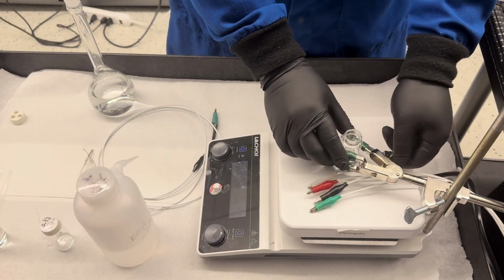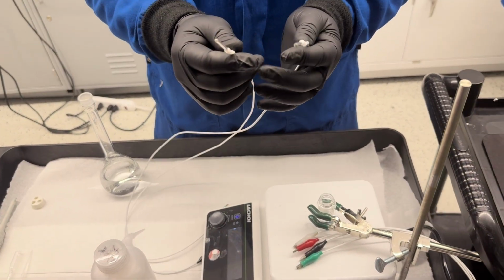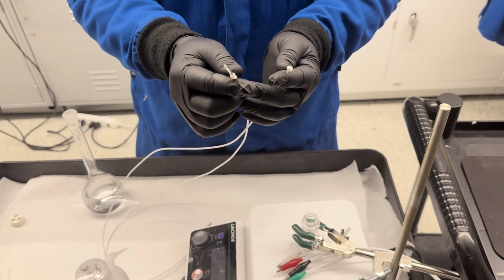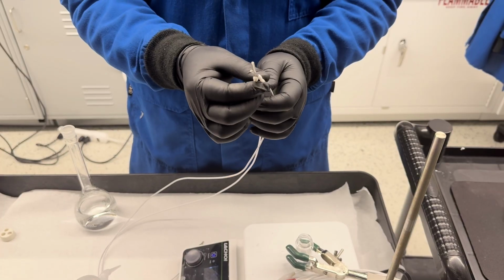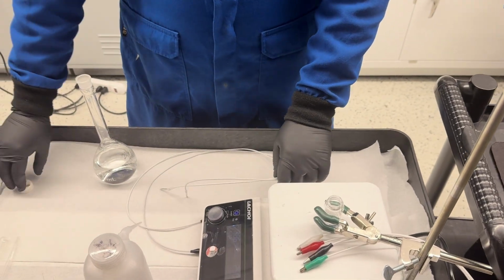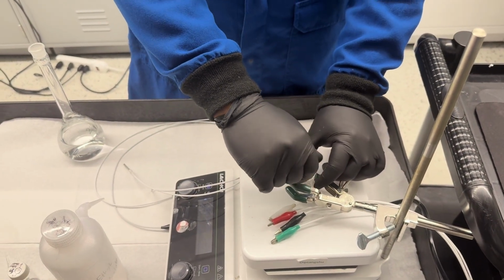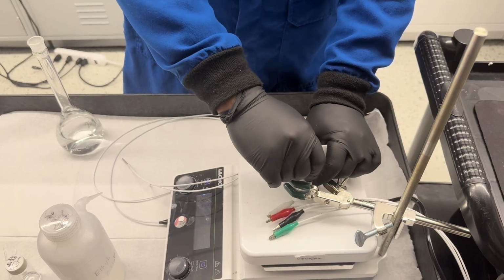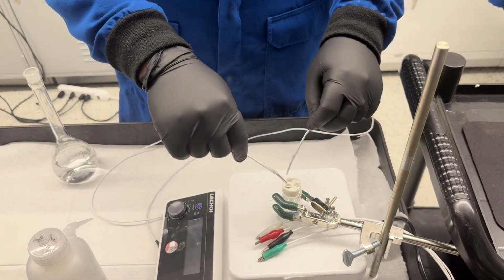When it is completely dissolved, we will use two identical silver electrodes for this reaction. These are the cathode and the anode, because we are using alternating current mode, so the cathode and anode are the same for this reaction. Now we set up the reaction, and we put the cathode and anode into the reaction mixture.